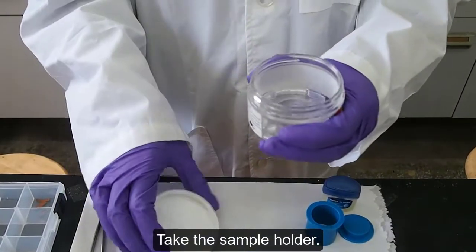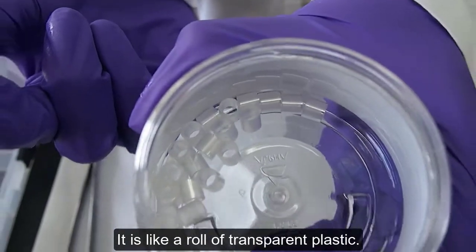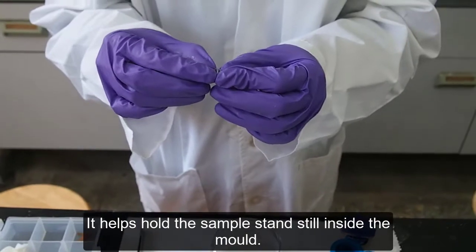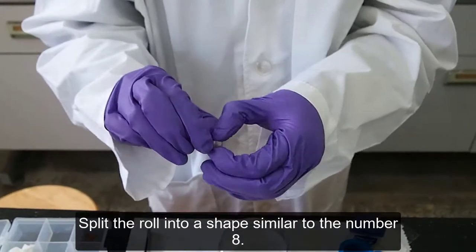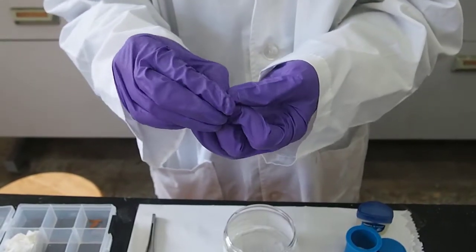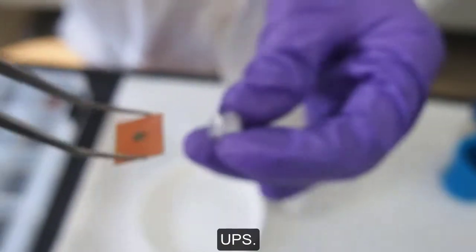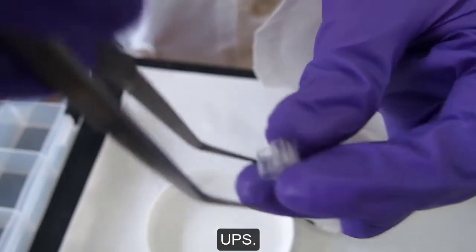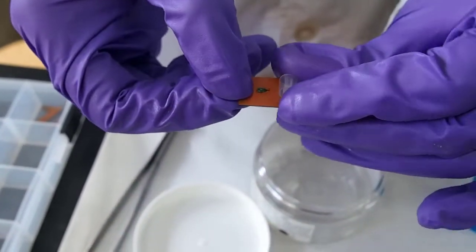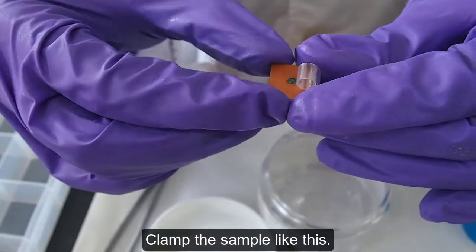Take the sample holder — it is like a roll of transparent plastic. It helps hold the sample standing still inside the mold. Split the roll into a shape similar to the number 8, then put the sample in between it. Clamp the sample like this.